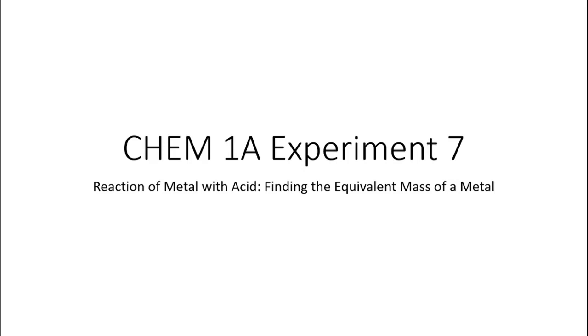Hello students, this is Dr. DA, and today you're going to be doing an activity called Experiment 7 in your lab manual. This is the reaction of a metal with acid. Our task is finding the equivalent mass of a metal.